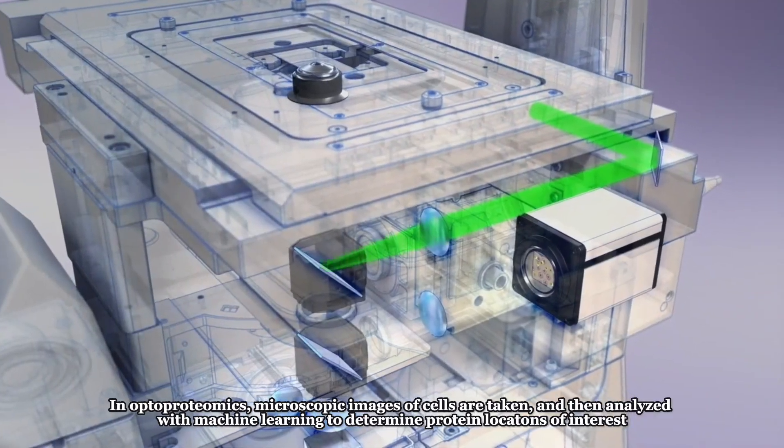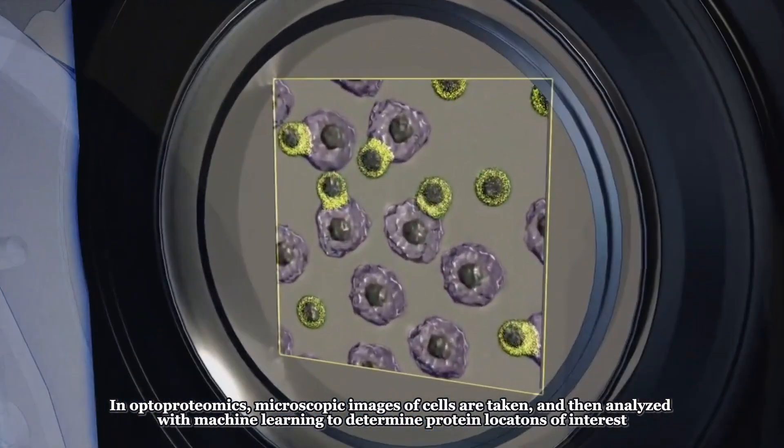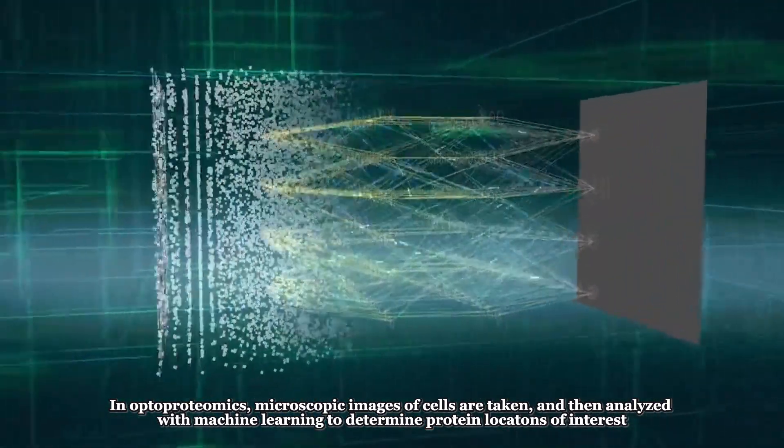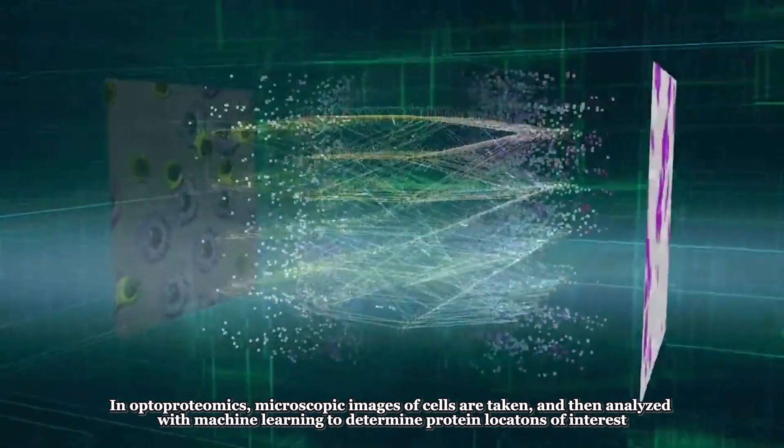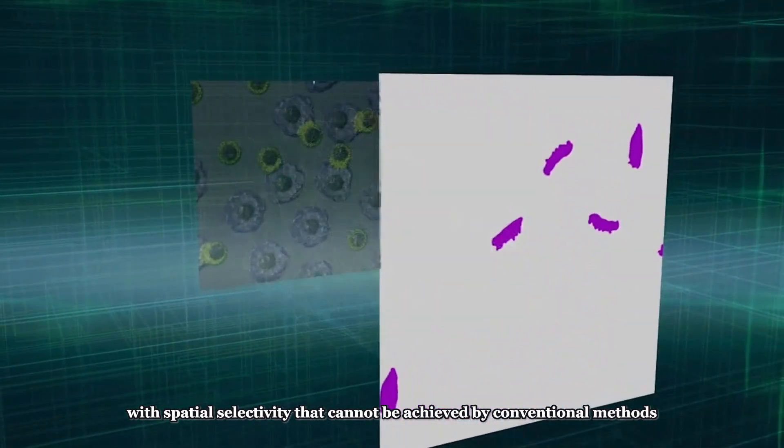In optoproteomics, microscopic images of cells are taken and then analyzed with machine learning to determine protein locations of interest with spatial selectivity that cannot be achieved by conventional methods.